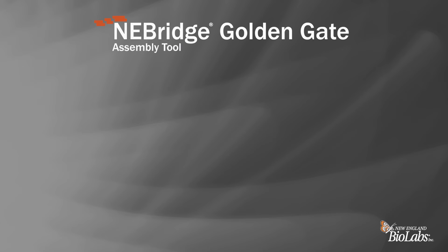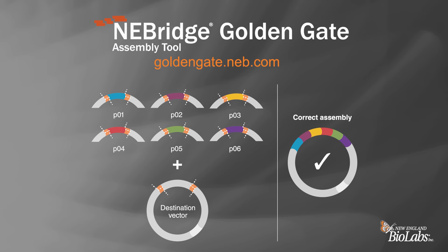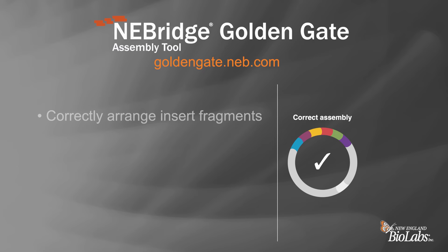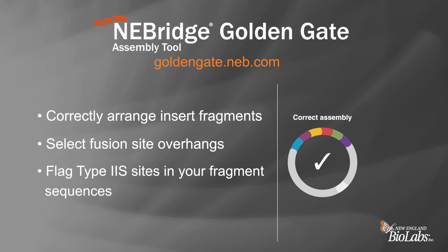The NEBridge Golden Gate Assembly Tool, found at goldengate.neb.com, simplifies in-silico DNA construct design. We recommend using this tool to visualize your assembly designs and confirm the desired final sequence. The Golden Gate Assembly Tool is used to arrange the insert fragments in the correct order, select fusion site overhangs, and also flag any Type 2S recognition sites within your fragment sequences for the enzyme used in your design.